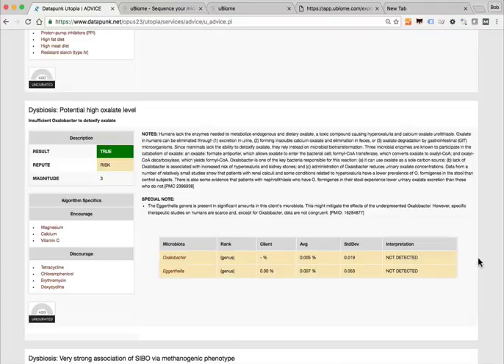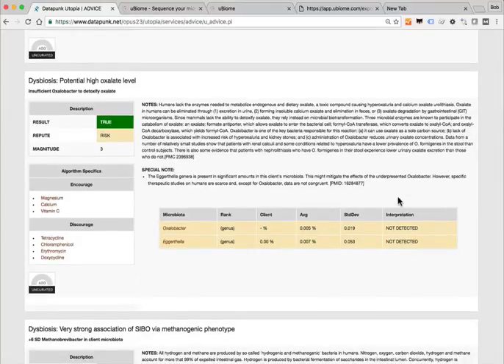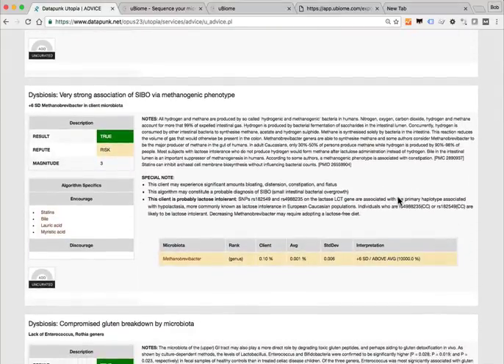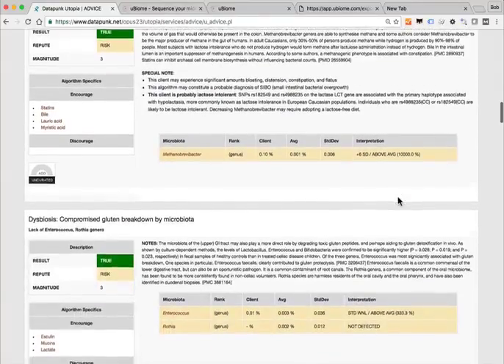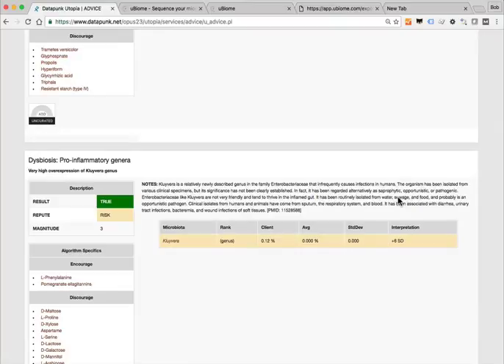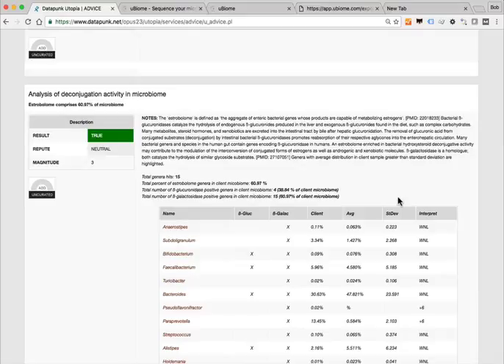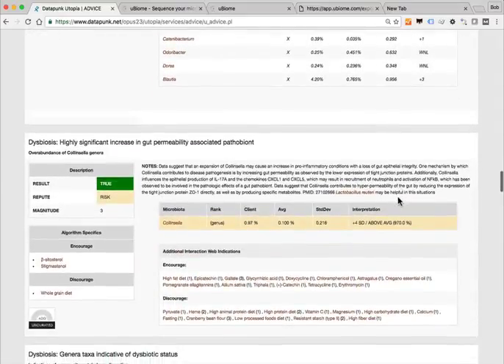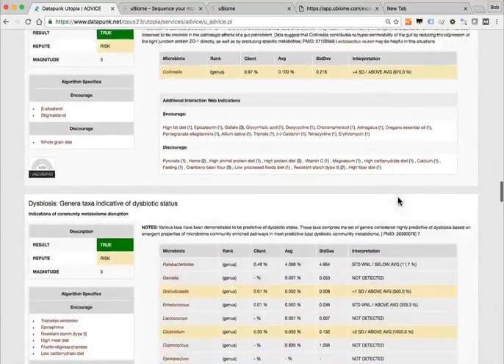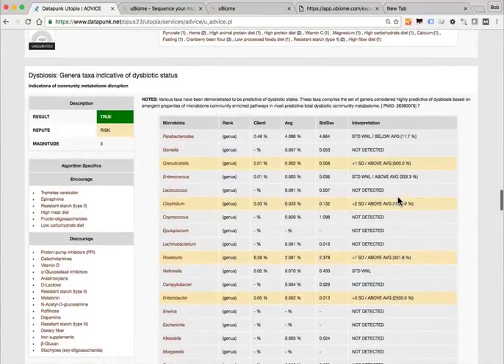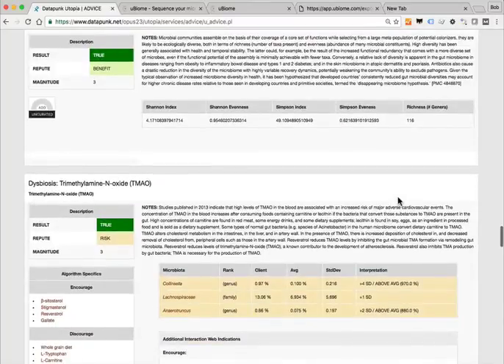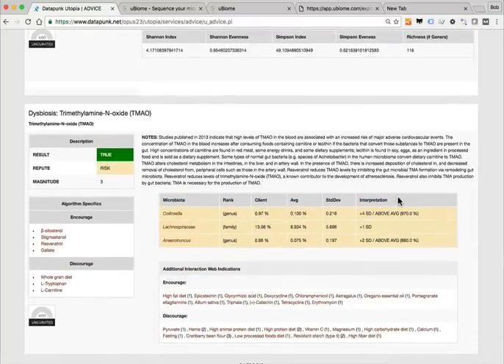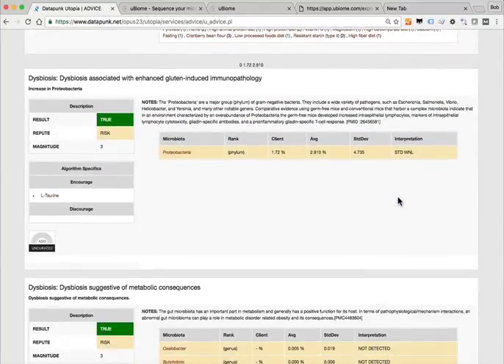That conclusion can only be drawn if the program knew the secretor status, which is obviously the power of where we're going. The initial stages of utopia are very simple, but going forward the bigger area with the most potential is constantly weaving genetic and microbiome data and synthesizing it. It does it for you — it automatically pulls the data from Opus, you don't have to flip back and forth. Here's another algorithm showing potential for high oxalates based on the lack of two oxalic acid-metabolizing bacteria, and here's the association for methanogenic phenotype with SIBO.